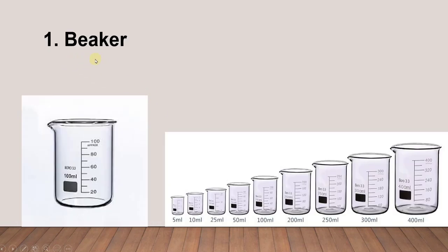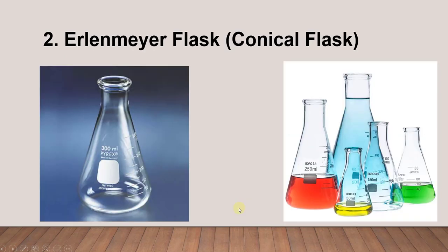First is the beaker. We have different sizes for different volumes of solution. Next is the Erlenmeyer flask, also called a conical flask.